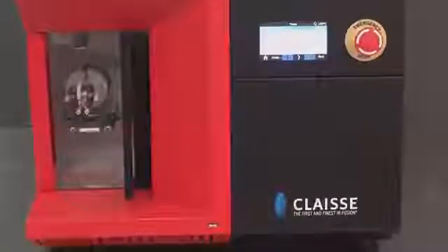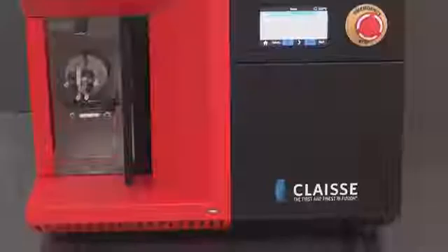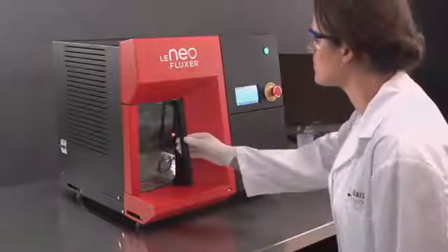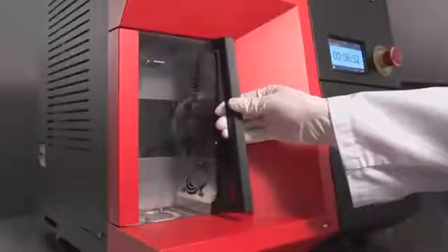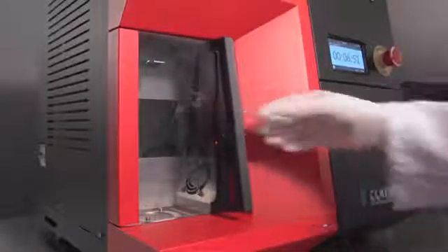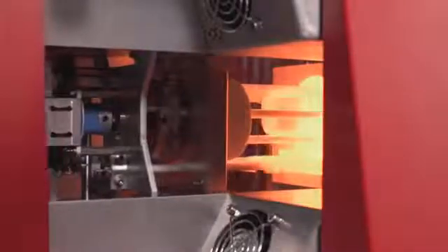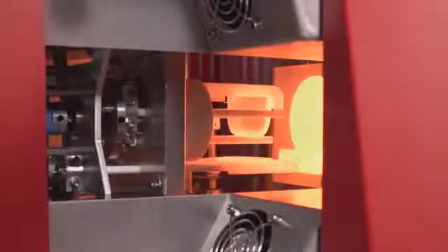Ultimate safety — that's another outstanding feature of this fusion instrument. The safety door automatically locks during the entire fusion process to protect the operator against heat, moving parts, and spatters. Because it's fully automatic, this instrument avoids the manipulation of hot vessels and direct exposure to hot external surfaces.